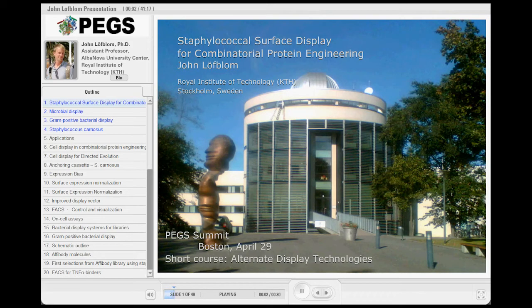Today I'm going to talk about a bacterial display system that we have developed at the department called Staphylococcal surface display. And I'm going to mainly talk about the applications where we use it for combinatorial protein engineering for selection of new affinity proteins, both antibodies but also other alternative scaffolds.